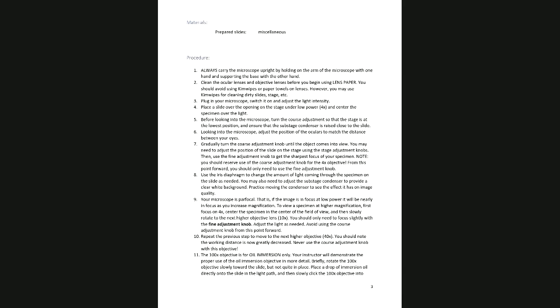And the reason why you go back to 10x is because you can easily focus through the oil. That's not a problem. And from the 10x, you can jump back to the oil lens. So you can go from 10x to oil. That works just fine. Right? Because remember, now you got oil on the slide, you can't go back to high dry because there's oil on the slide. But you can go from 10x to oil, and that works just fine. And then you find your specimen.